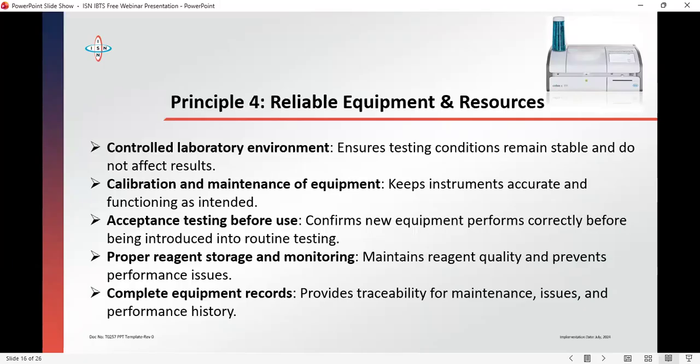If it fails, your instrument will tell you it fails, because they have a 95% confidence limit of the certified reference material; if it operates above it or below it, your calibration will fail. The acceptance testing before use. Like I said before, did you validate the instrument? When you got a new kit, did you test it to find out that it's working correctly? These are very, very important requirements. You can test it by running control, you can test it by running QC, but you need to test the precision before you even put it to use. Are they reproducing well? And it is not just done once.